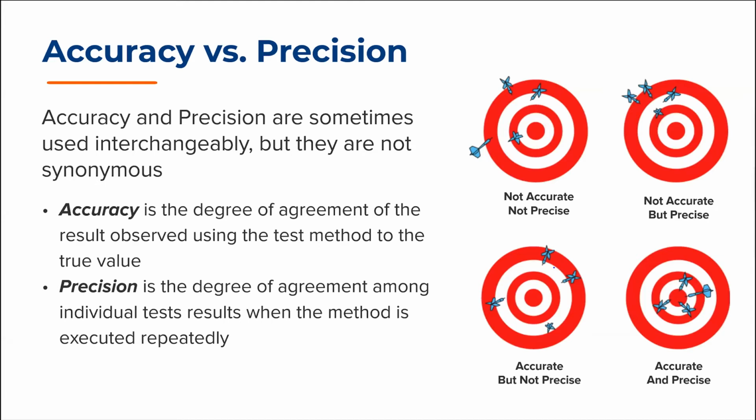Okay, finally getting to validation. To start, the first figures of merit we want to determine are accuracy and precision. But before launching into a detailed discussion of these two figures of merit, I want to review the differences between them as they are often confused.